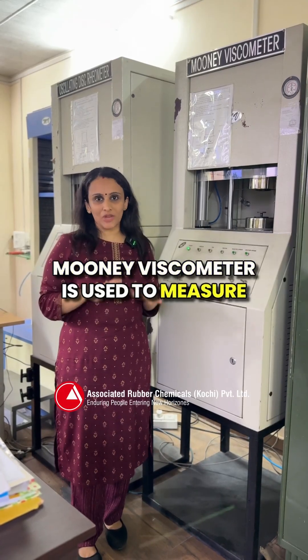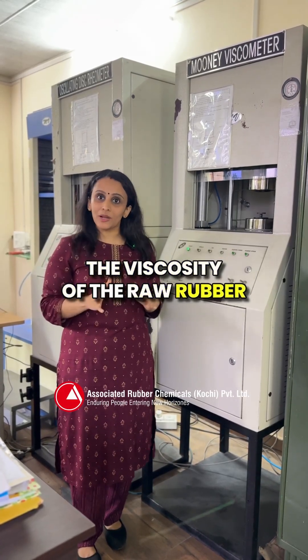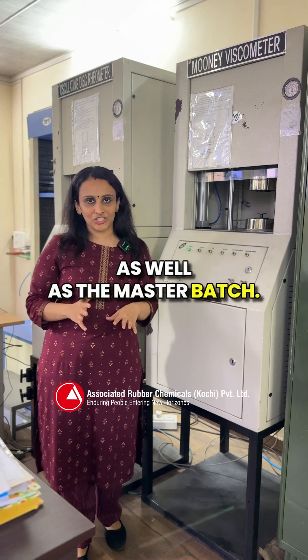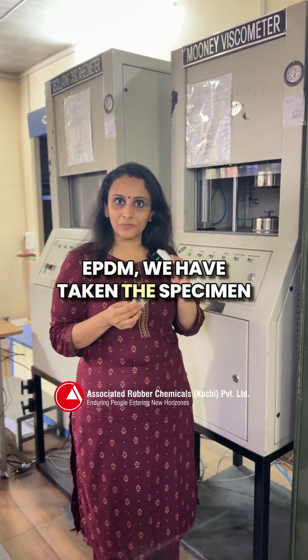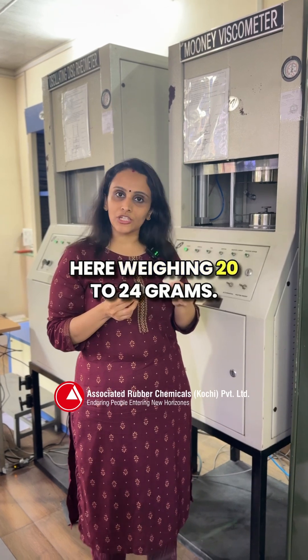The Mooney viscometer is used to measure the viscosity of the raw rubber as well as the master batch. To test the viscosity of the raw EPDM, we have taken the specimen here weighing 20 to 24 grams.